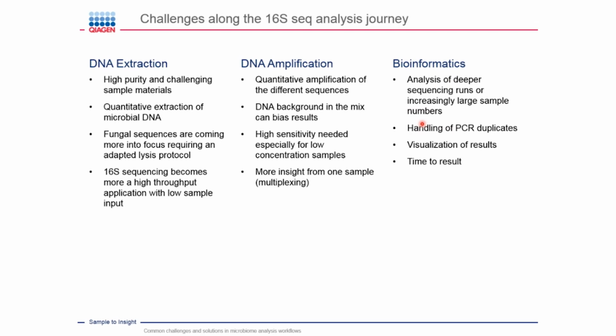And later on, you just don't want to have pure data tables. You want to have them visualized in a good way, ideally usable for a publication or for the next meeting with your lab to present what you're doing. The last point is you don't want to wait 2 weeks for your NGS analysis, so there is the need to have a workflow which has a short time to result and to give the results you need. So that's the challenges before we start into the DNA extraction and amplification.